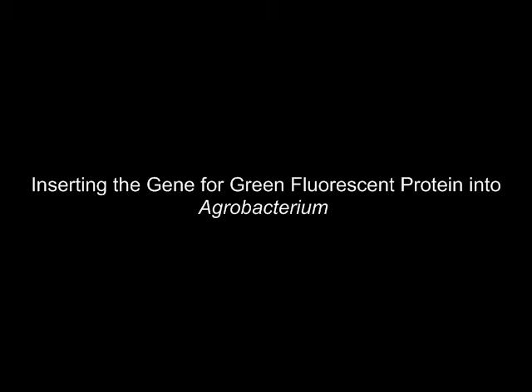In this experiment, we'll be inserting the gene that causes green fluorescence into Agrobacterium tumefascians, Agrobacterium rhizogenes, and Agrobacterium radiobacter.